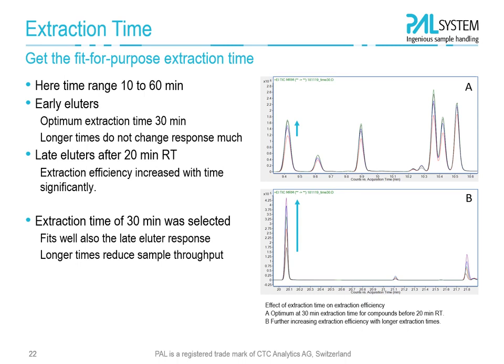With regard to the extraction time, we look at these two sites as well. Here we tried different extraction times from 10 to 60 minutes. If we look at the early eluters, an optimum here is already reached after 30 minutes. Longer extraction times, as we discussed this already in the beginning, do not change the response much. But for the late eluters, after 20 minutes retention time, the extraction efficiency increased significantly with the extraction time.